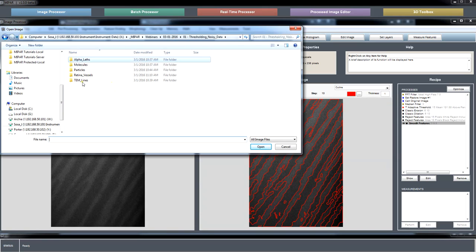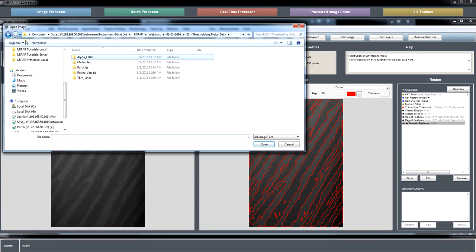Do we want to see another one of these examples I have queued up here, or move on to a different topic? I'm not going to necessarily treat the general overview. I think I kind of already did that. I have it second on my list, but I think the general overview has happened and will continue to happen just by showing all of the features. So do folks want to see another segmentation example here, or do you want to move on to something else?